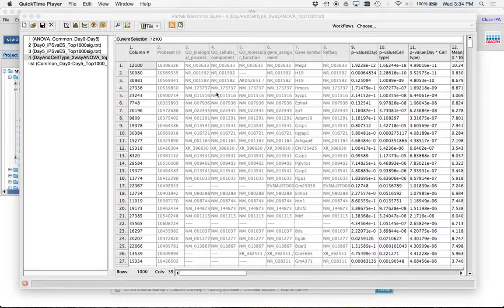So we eliminated the outlying study, and so we were left with, I believe, 18 samples, or was it 9? I can't remember. I think maybe it's 9. It is 9, isn't it? No, wait, 18. 18 samples. Just containing pluripotent stem cells and embryonic stem cells at day 0 and day 5 when they're differentiated.